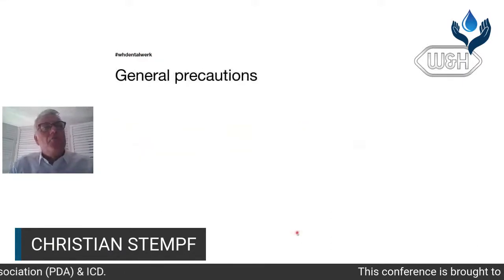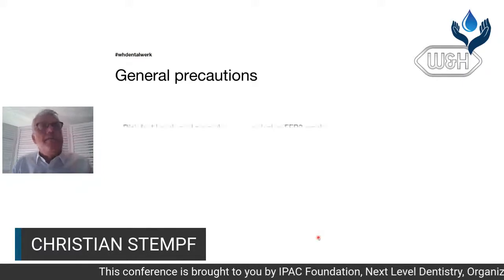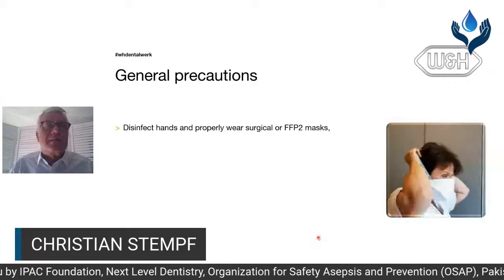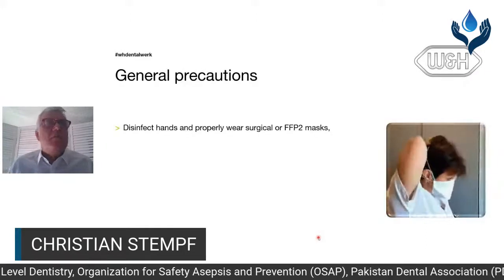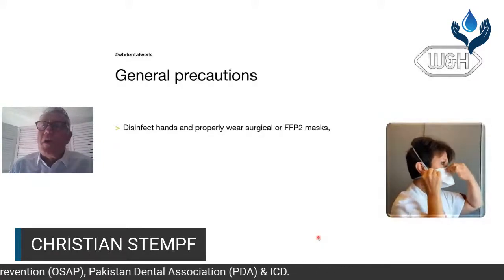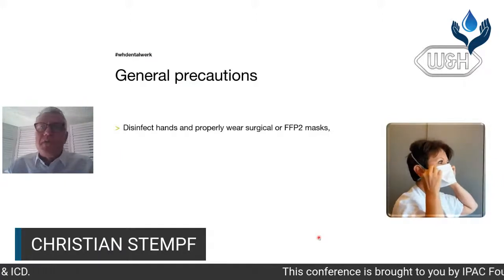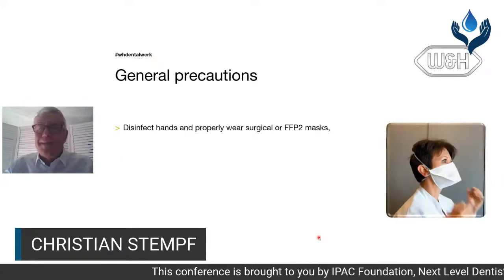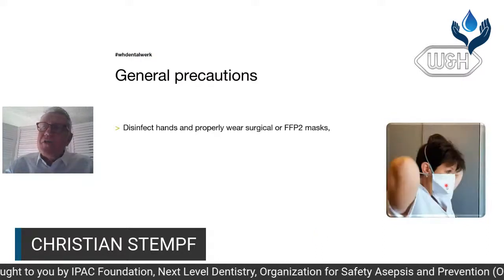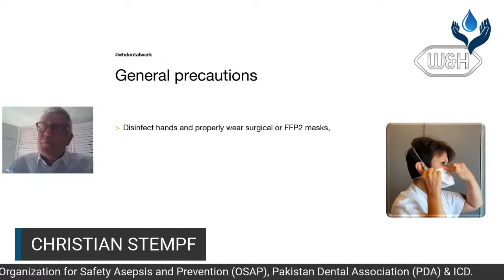Now, I lectured on reprocessing masks. That's absolutely forbidden. Many countries tolerated this procedure because there was a lack of masks. So obviously, what can I do? The best thing was to reprocess my mask. But it's a single-use mask that you have to wear properly. Of course, men with beard and moustache don't make it easy for tightness. Avoid touching the filtration area, the front of your mask. Press the clip.